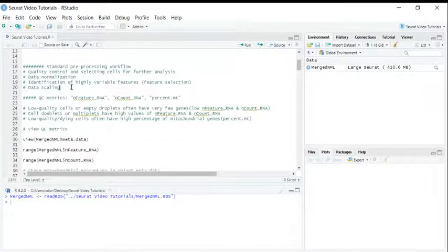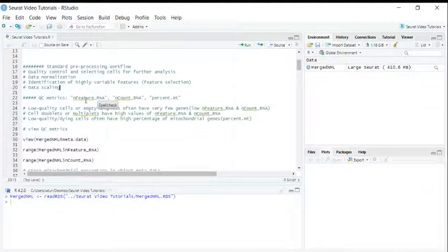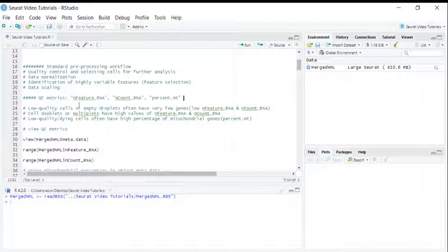In today's video, I'm going to talk about three commonly used quality control metrics. They are n-features RNA, n-count RNA, and the percentage of mitochondria genes.